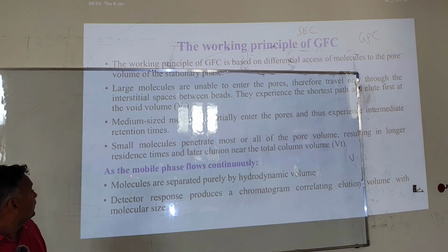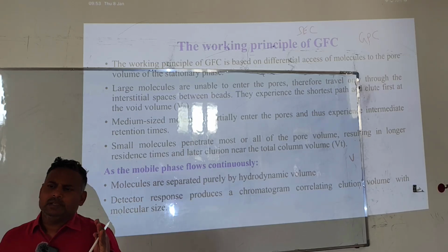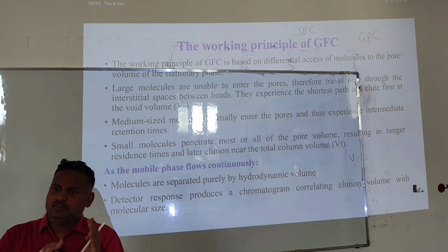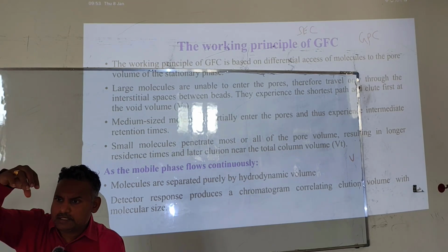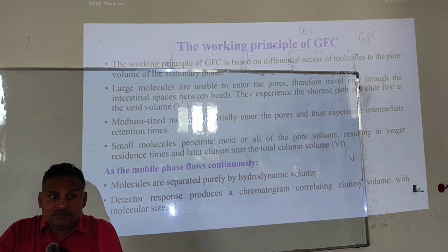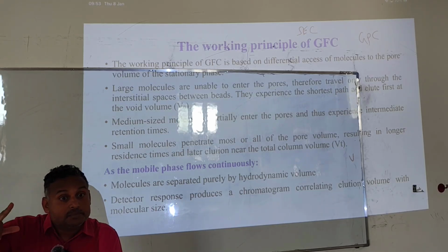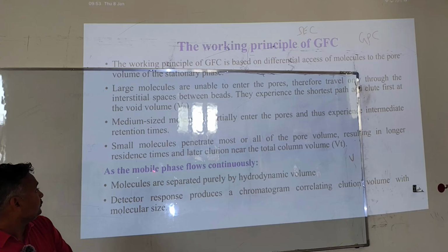Right. Yeah, the mobile phase flows continuously. Of course, when we are saying chromatography, it is common: we have a stationary phase and a mobile phase. The mobile phase will be pushing the molecules to pass through the stationary phase. While they are moving in the stationary phase, they will migrate with different migration rates, which makes them get separated. Is it clear?